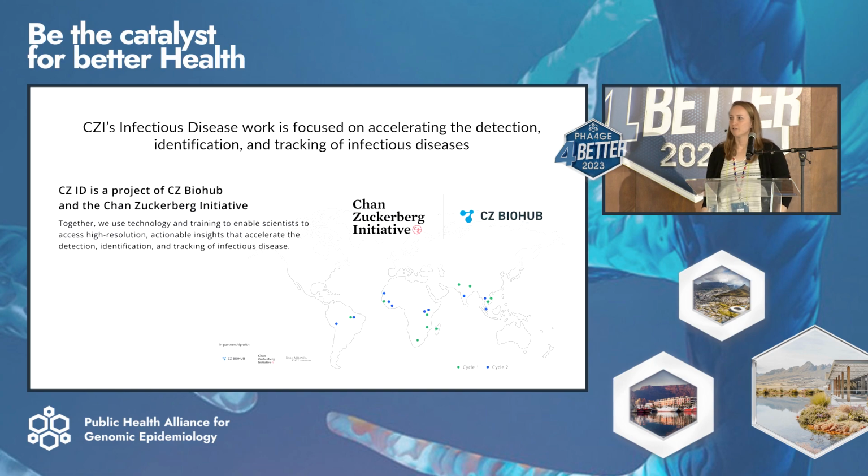So just by way of a little bit of background, CZI's infectious disease work is really focused on accelerating the detection, identification, and tracking of infectious diseases. And so we do this by partnering very closely with the Zuckerberg Biohub in San Francisco to provide technology tools as well as training needed to enable high-resolution detection of any pathogen around the world.